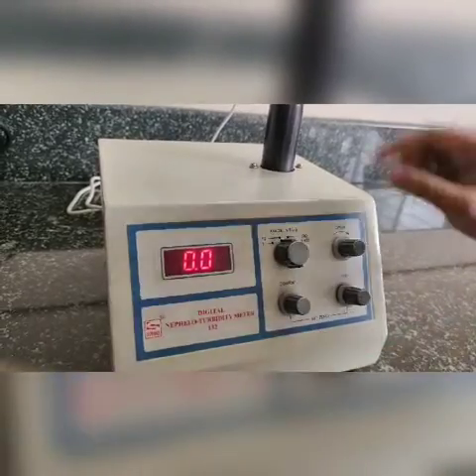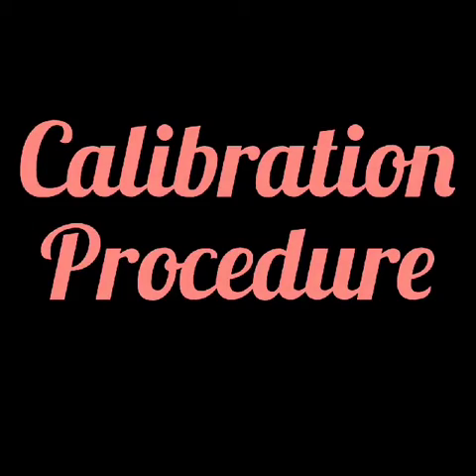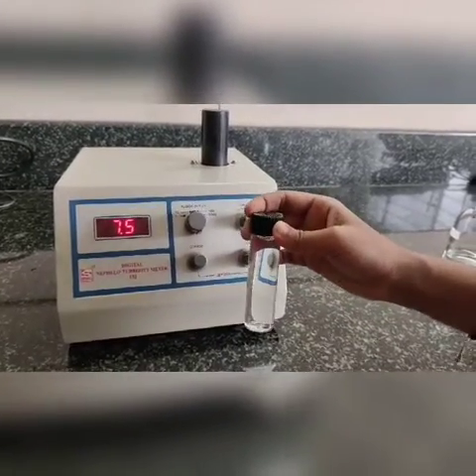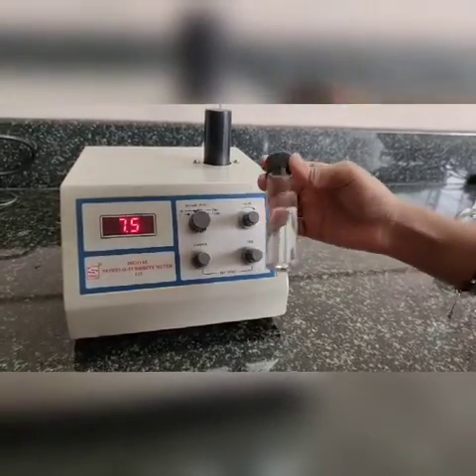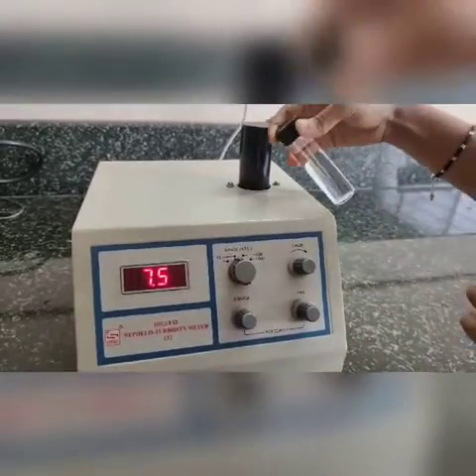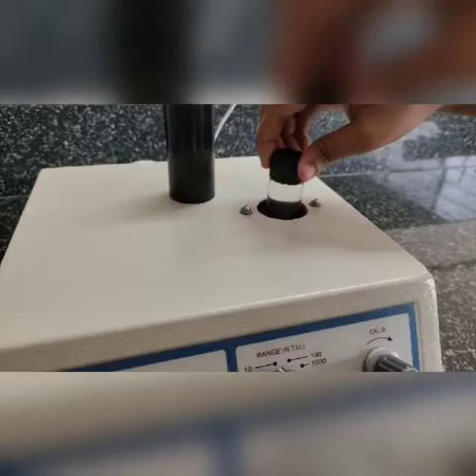Once it is set to zero, remove the sample. For the calibration procedure, first fill the bottle with 1 NTU standard solution and wipe it. You can fill it fully or three-quarters is enough. Place it inside and coincide it with the line.